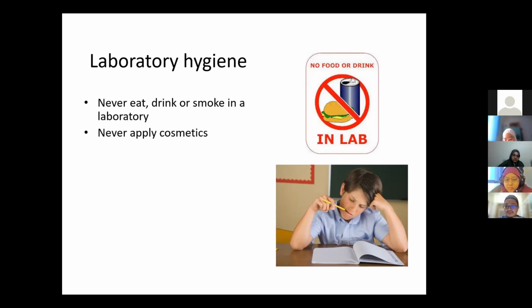Some lab, they may not want you to wear contact lens even, because depends on the procedure, because sometimes mungkin takut cair ke apa dalam mata, something happen because you are using solvent, etc. Also sometimes saya pun pernah pakai contact lens, sometimes it becomes very dry kan, kita buat prosedur lama-lama very dry, and then dia macam terkeluar tau, dia on its own sebab dia dah jadi very dry, and then that basically bila it happens, we are being distracted, and that can lead to other things lah.